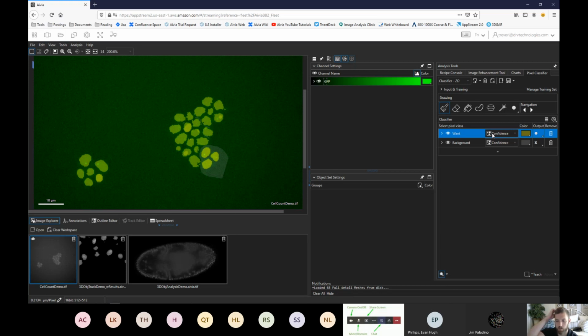That means we're actually looking at a map where each pixel is reporting how confident the algorithm is, from 0 to 100% at each pixel, that it belongs to a certain class. So the output of that is actually just another image, but it's just cleaned up. So the signal to noise is greatly increased. A pre-binarized image you can think of.